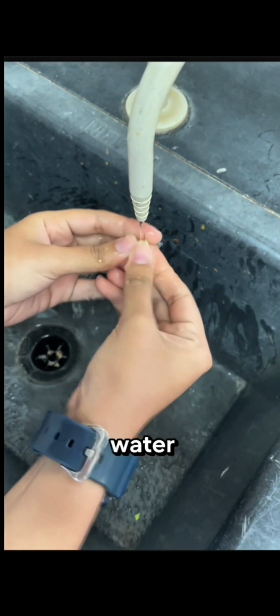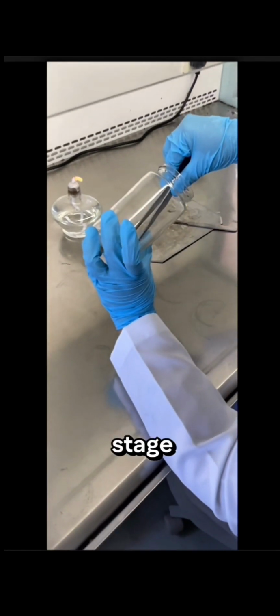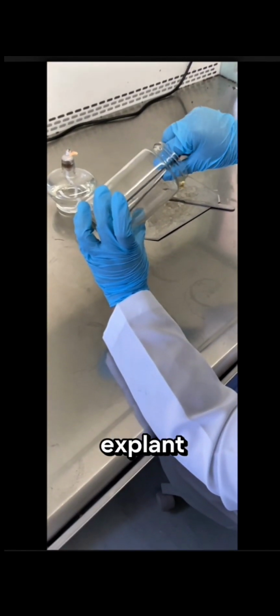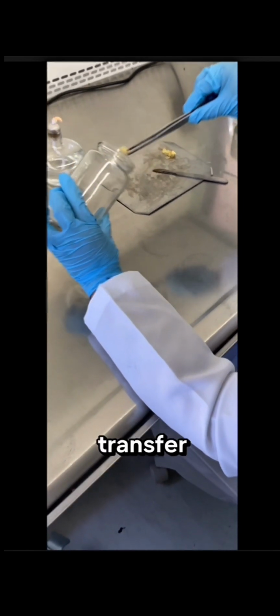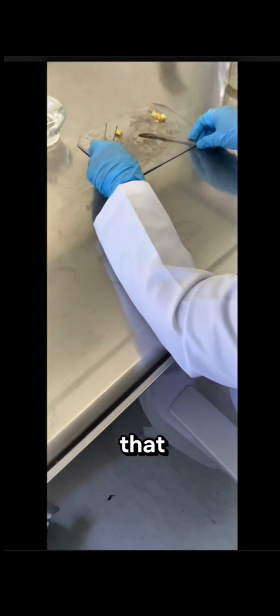The result part. For the sterilization part, the explant preparation, we successfully cleaned it properly using tap water for 30 minutes. For the multiplication stage, we cut the sterilized explant into small sections and carefully transferred them into the MS agar medium. We were also successful in doing that.